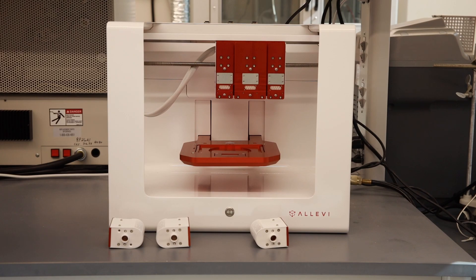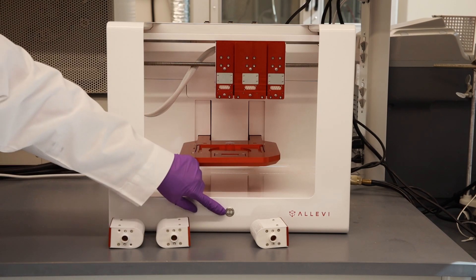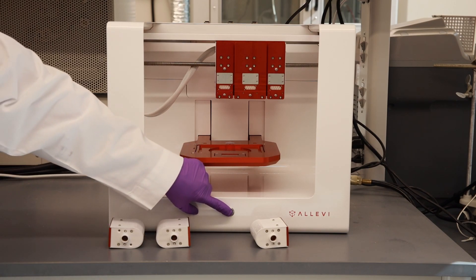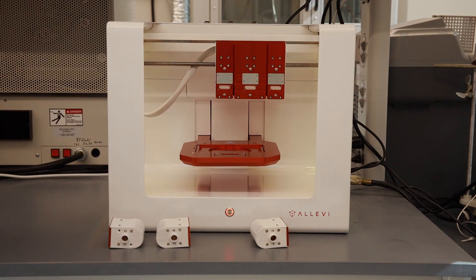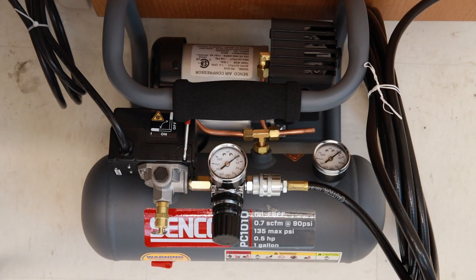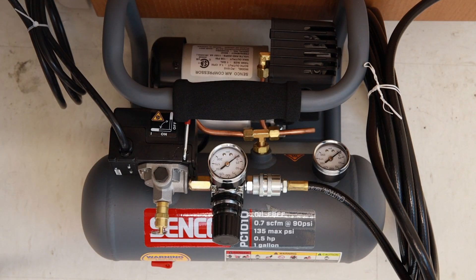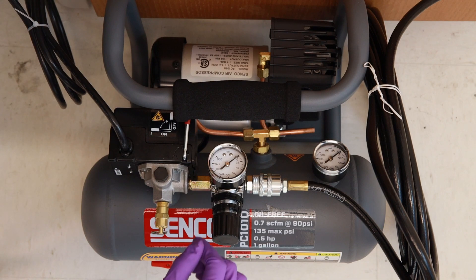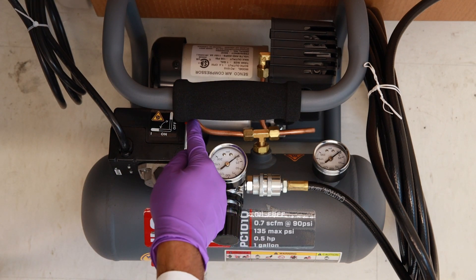Power on the bioprinter by pressing the power button here. Turn the lever position on the air compressor from off to on.